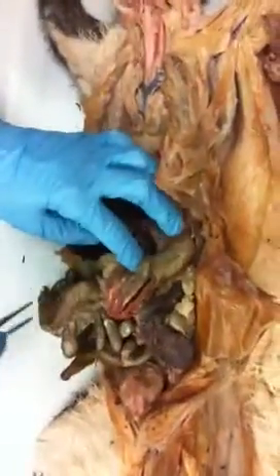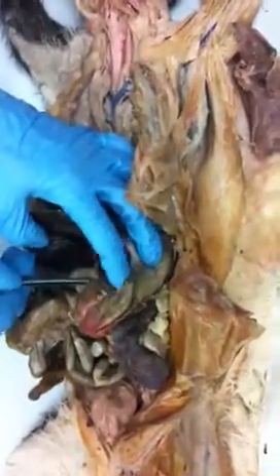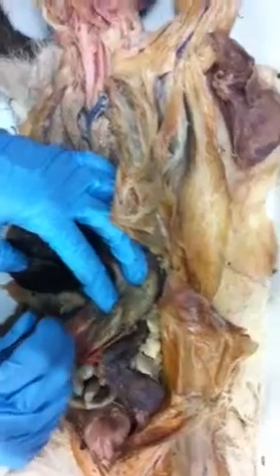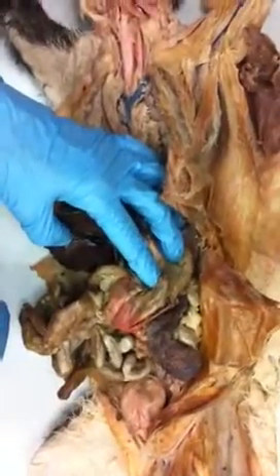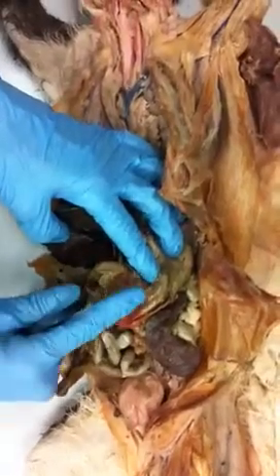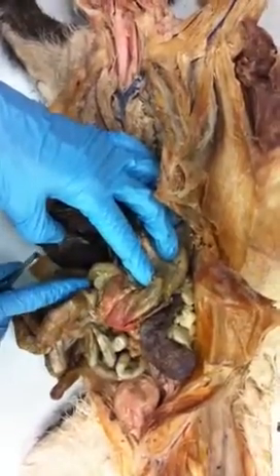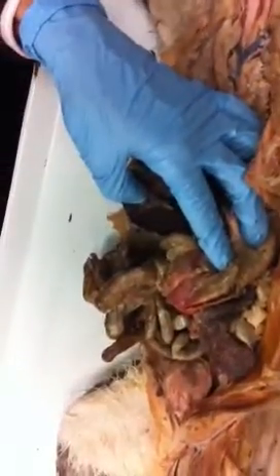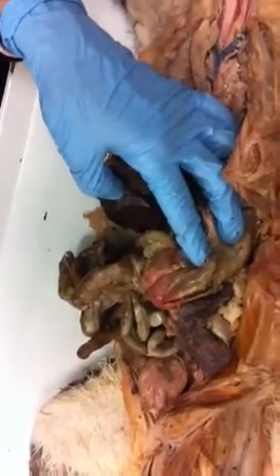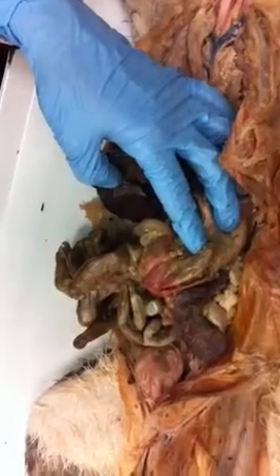Now, see how it looks like it's a little bit constricted right here, right at the bottom of the stomach? That's because there's another sphincter muscle right there. That's the pyloric sphincter. That regulates flow from the stomach to the duodenum, which is the first section of the small intestines. And it's critical that we regulate flow, and we only let it go in there one little drip at a time because it's very acidic.